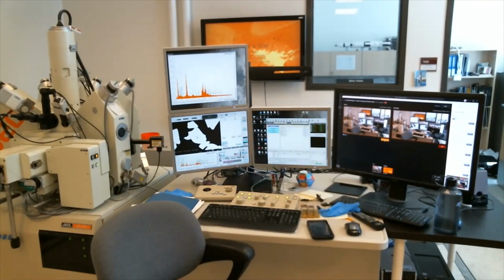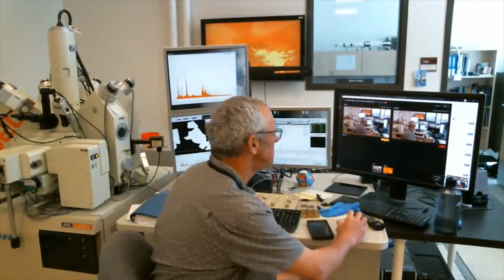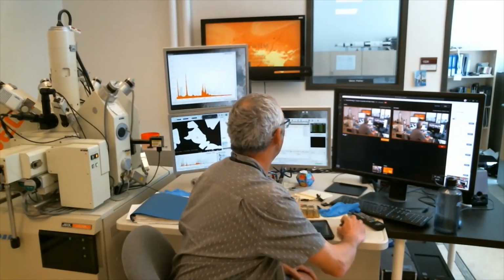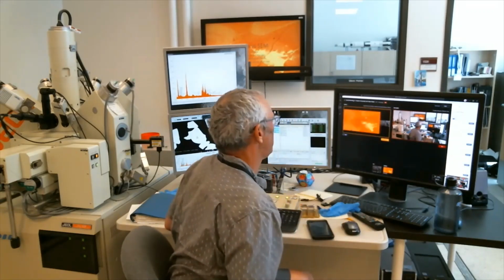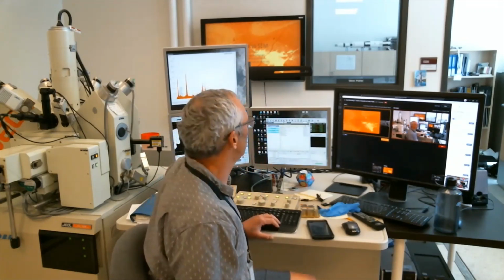And so let's talk about electron microscopy first. Just a little bit about microscopy. All right, the topic is called Probe versus SEM, but they're actually very complementary in what they can do for us.